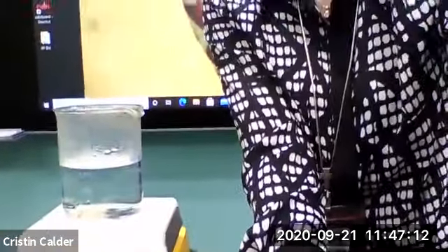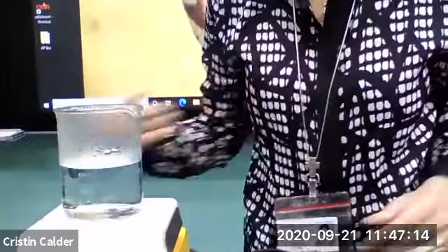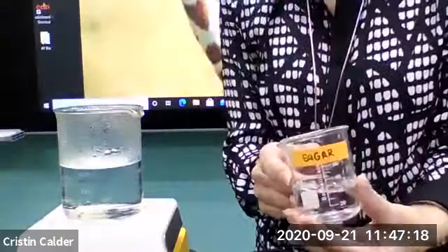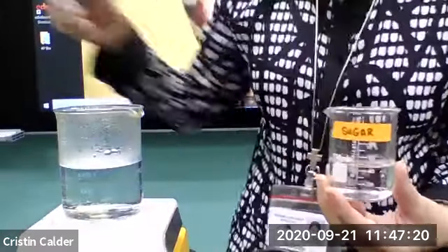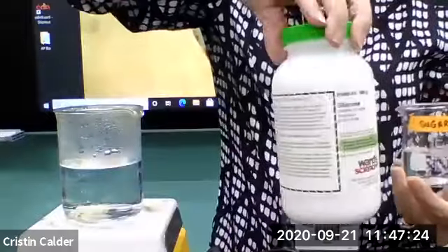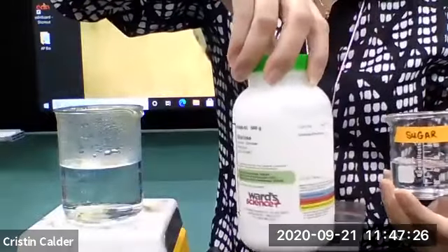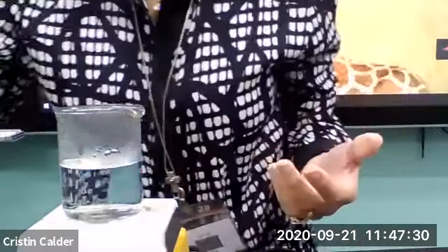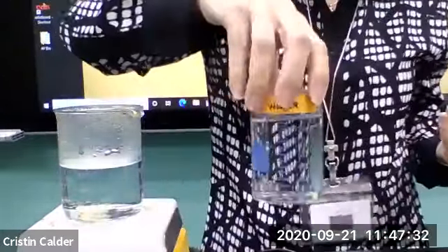So the first standard I'm going to run is the Benedict's test for sugar. Now that test actually requires heat. So I have a hot plate set up here, and I have 2 test tubes. In one of the test tubes, I have placed some sugar solution, which is actually glucose. I can show you the glucose here that I basically mixed up with some water. And in my other test tube is just plain old water.